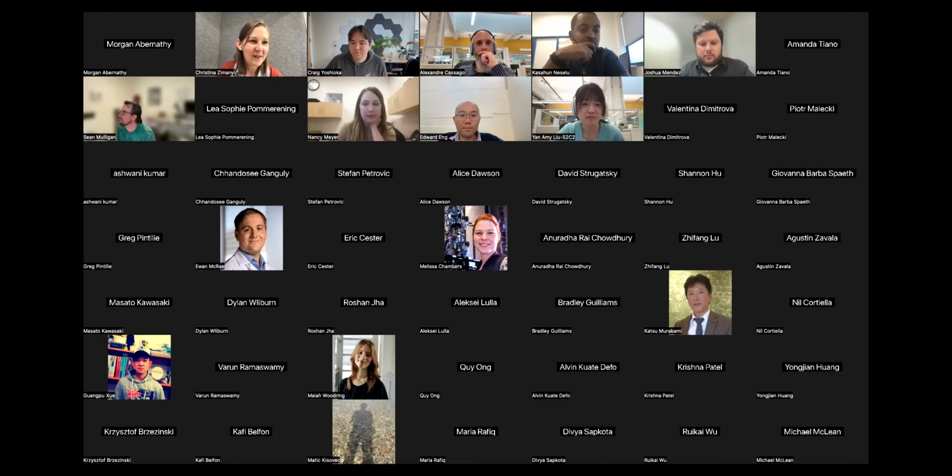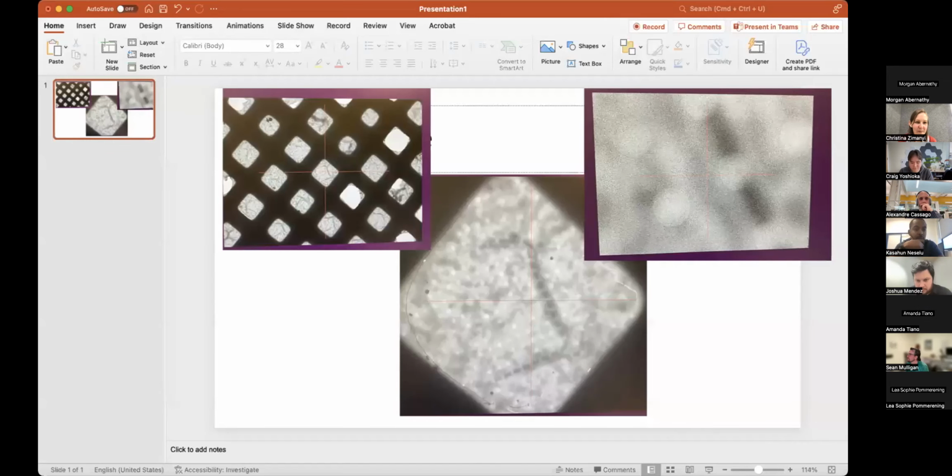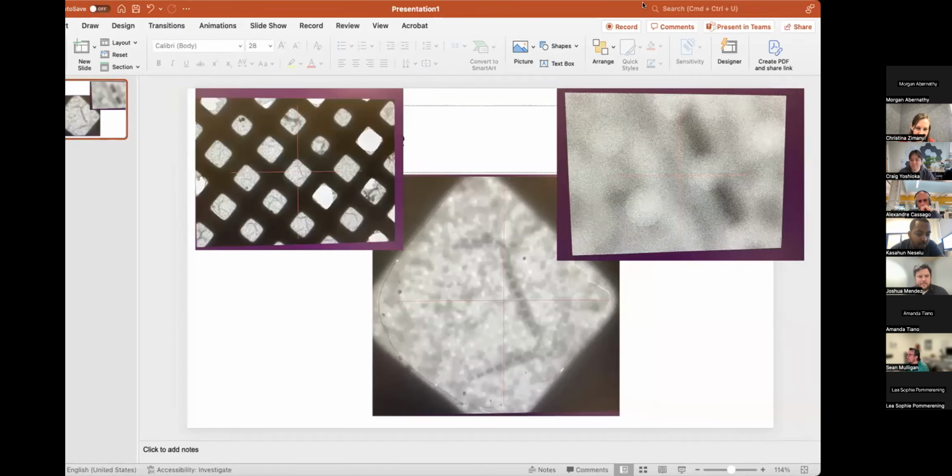Yeah, I have an image. Can y'all see this? Has anyone seen this before? It's actually from a while ago. I think it's protein aggregation and maybe some wrinkles in the carbon. I think the aggregation is the overall fuzziness, and then the wrinkles would be the dashes, because the dashes are so precise. Yeah, that's what I'd say.